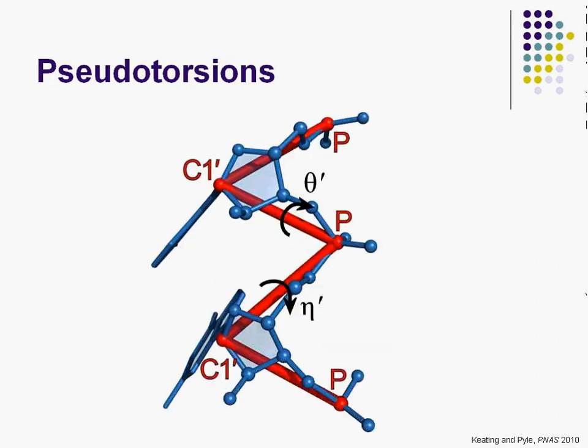One of the things of analyzing the RNA backbone that this plugin uses is the RNA pseudotorsions. These are things that we've been using in the Pyle lab for probably almost 15 years now. Behind the pseudotorsions, you simplify the RNA backbone down. I'm simplifying it down by looking at just phosphate and C1' atoms. In these atoms, you can define virtual bonds. I'm showing them here in red.